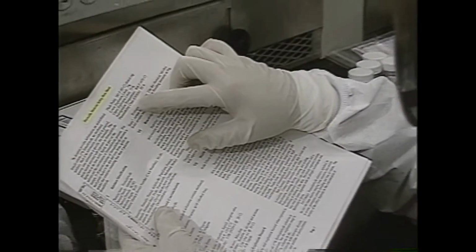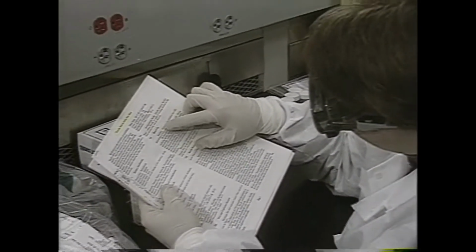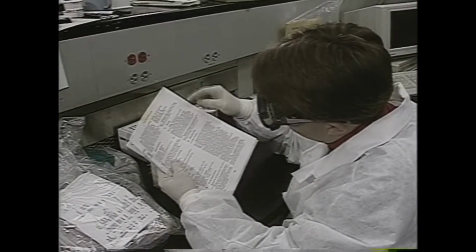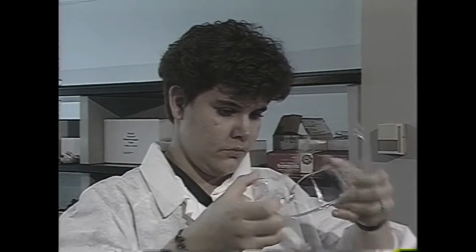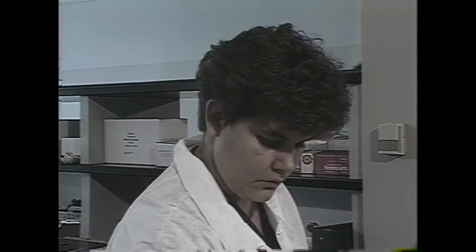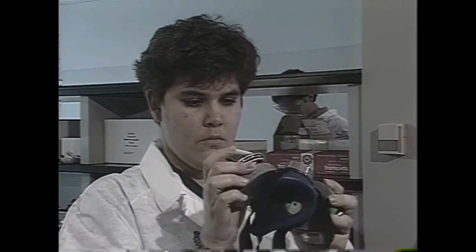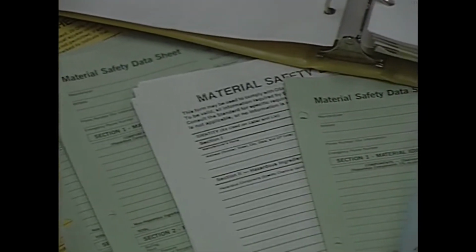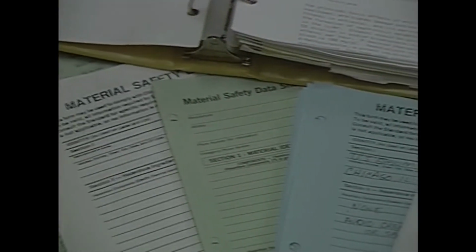To help you work with the chemical safely, the MSDS also tells you how to handle and store the chemical properly, and what exposure controls and personal protective equipment to use to protect yourself. Material safety data sheets can come in different formats, but they all contain the same kinds of important information.